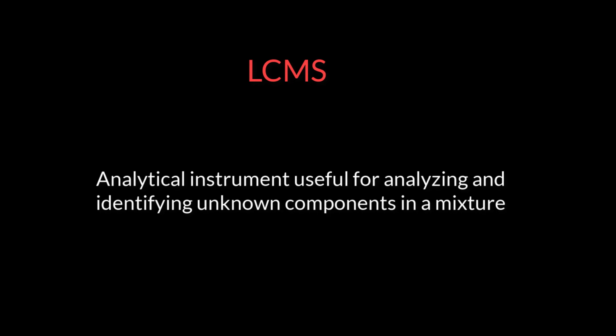Ultimately, using the absorbance data from the HPLC combined with the molecular mass data from the mass spectrometry, LC-MS can be a powerful instrument used to analyze and identify unknown components in a mixture.